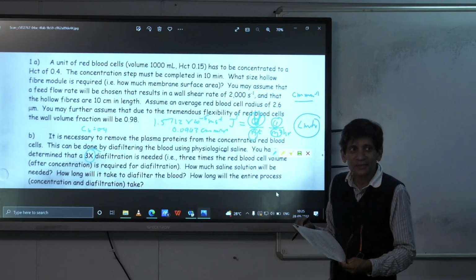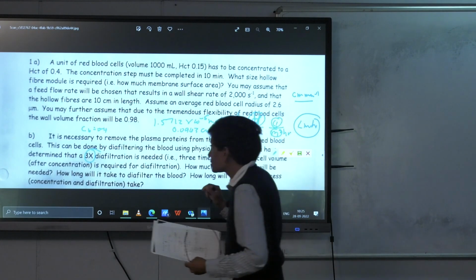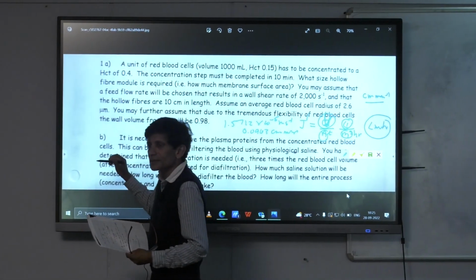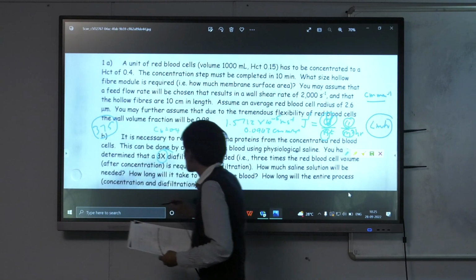Anybody? Sorry? You mean 375, right? 375. You're going to add 375 ml of saline, or how much? Look at this.